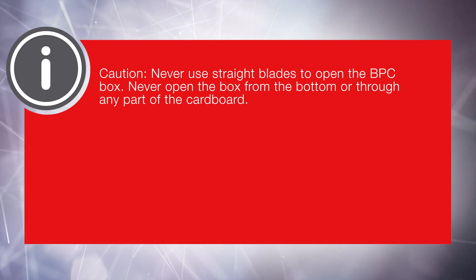Caution: never use straight blades to open the BPC box. Never open the box from the bottom or through any part of the cardboard.